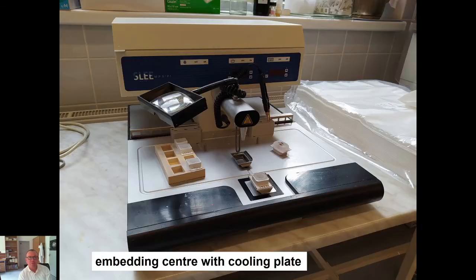Only the proper embedding has to be done by another machine, which is called an embedding center, where we can use molds of variable size according to the size of our tissue.